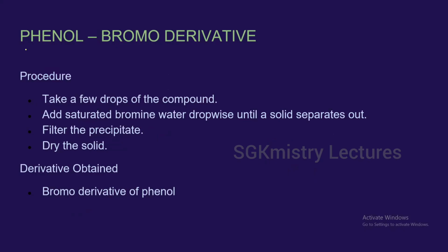Next, suppose the compound given to you is phenol, you're going to prepare the bromo derivative. Again, to a few drops of the compound, you're going to add saturated bromine water dropwise, again until a solid separates out.